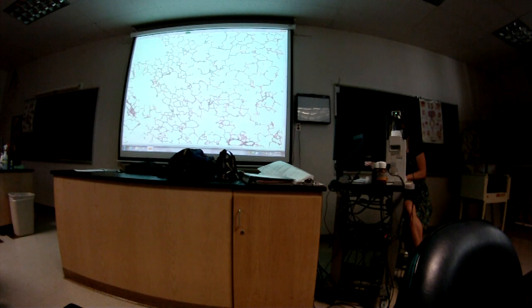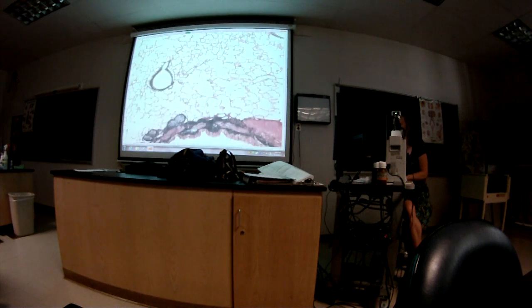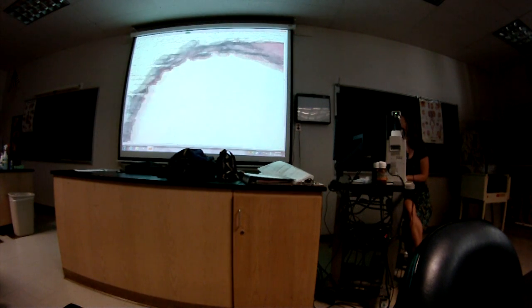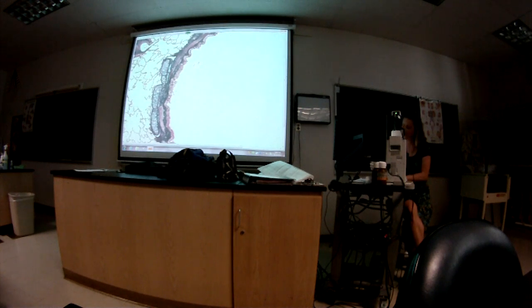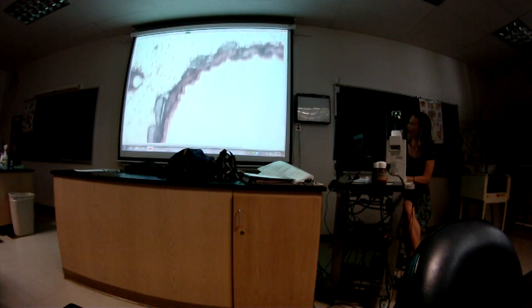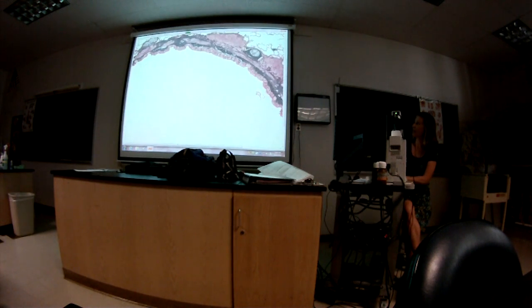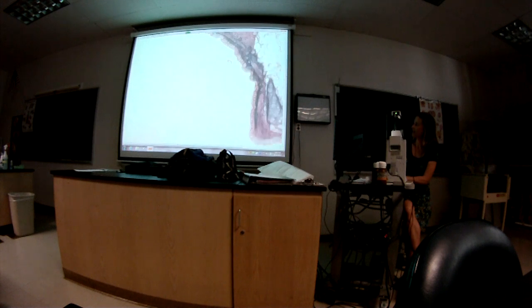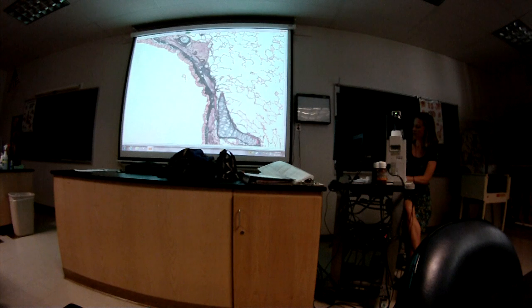There's one, but not a very good one. Let's see, was it the other slide I used? Okay, yeah, I used the other slide. But here's one we've got right here, so we might as well look at this one, and then I'll show you the other slide. This isn't the one I showed you, but it's the same thing. So question 10. First of all, it's larger, right? Because I'm on the scanning lens. I don't mind telling you which lens I'm on. I'm on the scanning lens, and we can't fit the whole thing on.